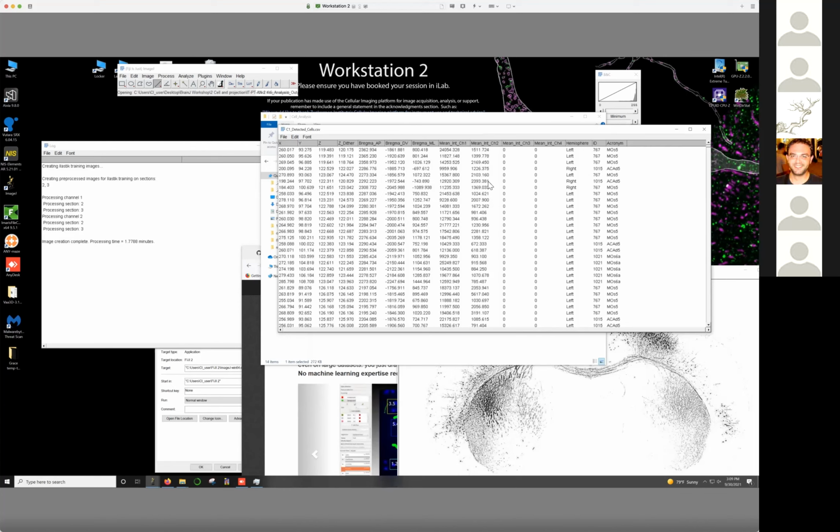That's my double labeled population. You can look at that in these intensity columns. We do give the bregma location. This is just based on comparing those atlases, so it's as accurate as we can get it, but just be aware that this is a calculation to get these.